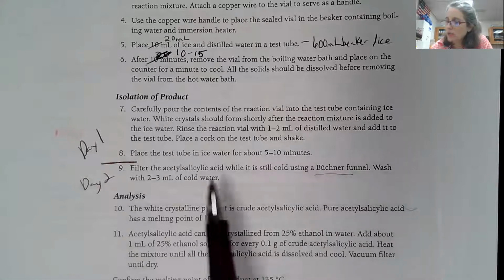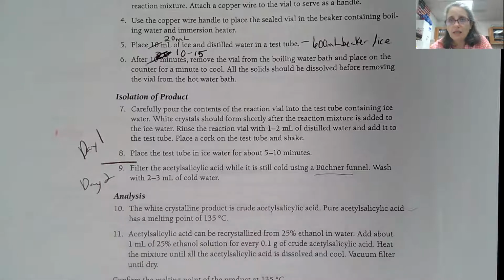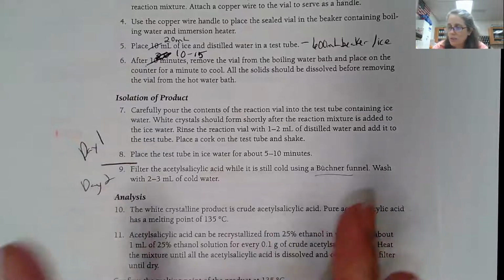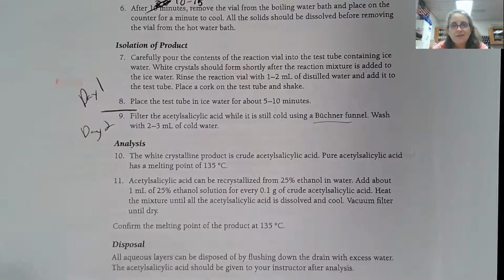Then on day 2, we would actually try to filter out what we have created in the test tube in what we call a Buchner funnel, which is also in the other video that you saw as reference. Once we have filtered it out, we are going to let it dry for a couple of days, and then we're going to do a couple of tests.